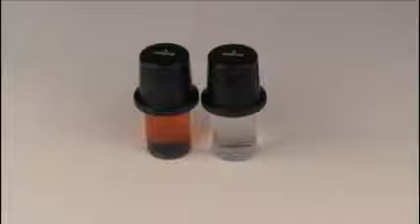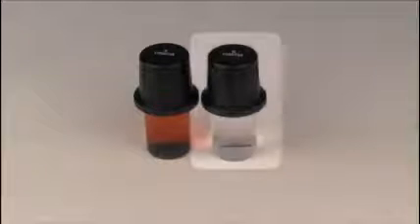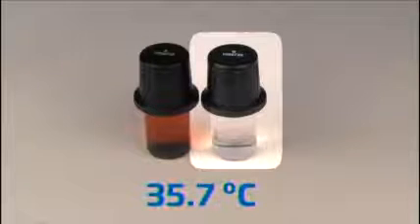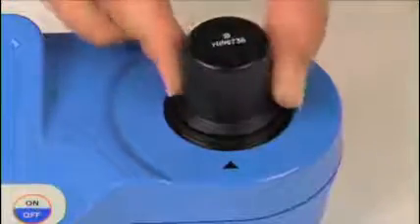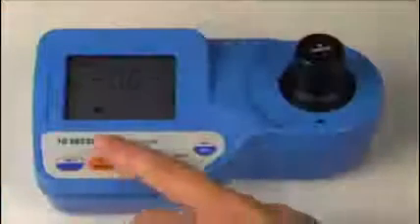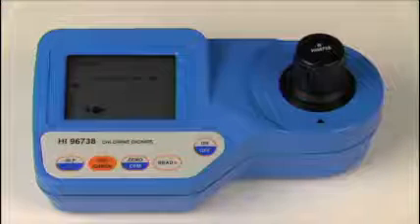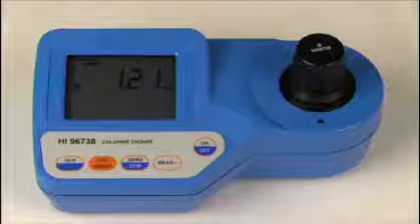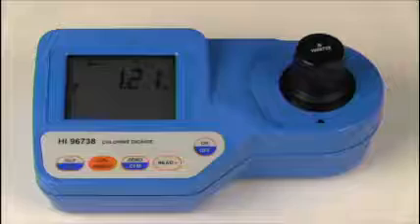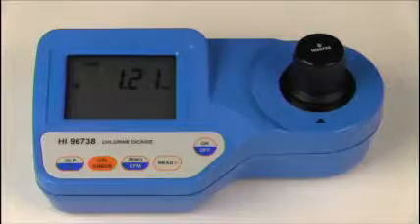Now we are going to read the one milligram per liter standard that has been warmed to 35.7 degrees Celsius. We will zero the meter, wipe the standard of any dust or prints, place the warm standard into the meter and perform a calibration check. The warm standard reads 1.21 milligrams per liter, which is higher than the expected value of one milligram per liter.